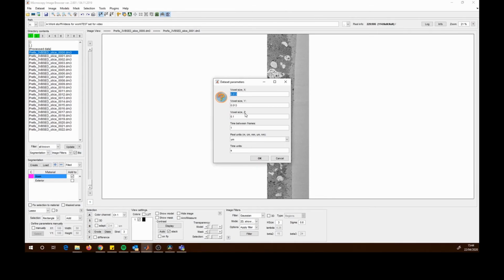It's also got the voxel size, which is 0.1, because we're dealing with slice thickness in the 3View and in serial block face scanning electron microscopy. Then it's the slice thickness that makes the Z value. So it's always going to be bigger than the X and Y.